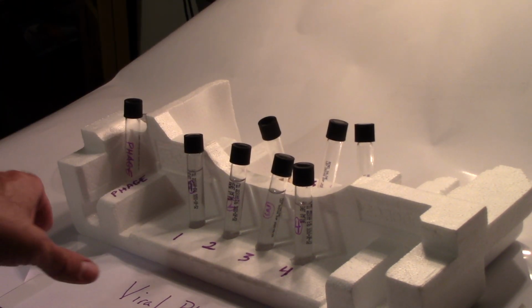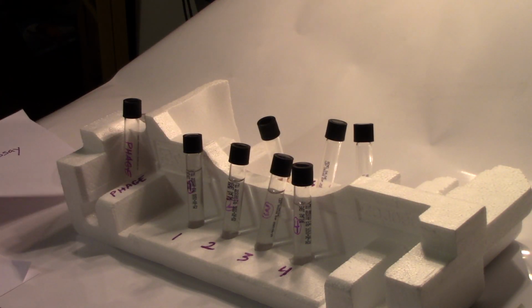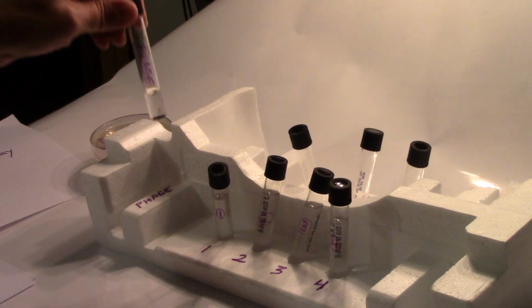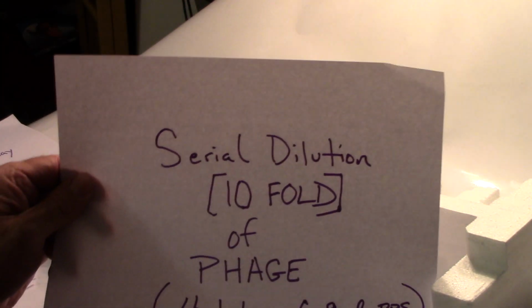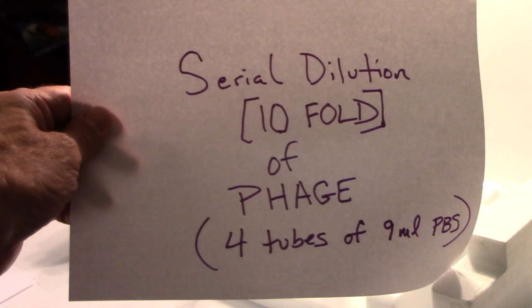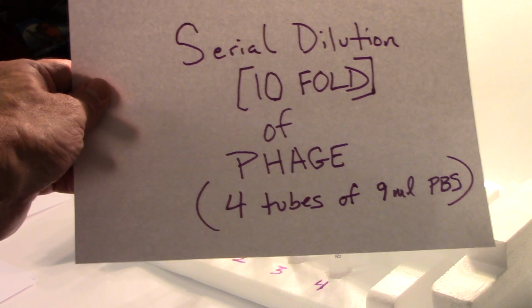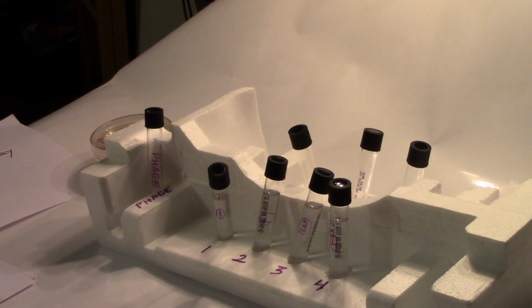Okay, we're going to try something called a viral plaque assay. And the way we're going to perform this is I have some phage here. And we're going to use this phage to carry out a serial dilution. It's going to be a 10-fold dilution of the phage in these 4 tubes. I'm going to carry it out right now.